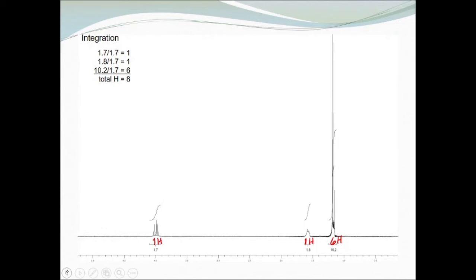So how do we identify the OH? For all of these, it's a monoalcohol. That means there is only one OH, which means the integration will be 1. So we have to look for a peak that integrates to 1. We have 2 of them.